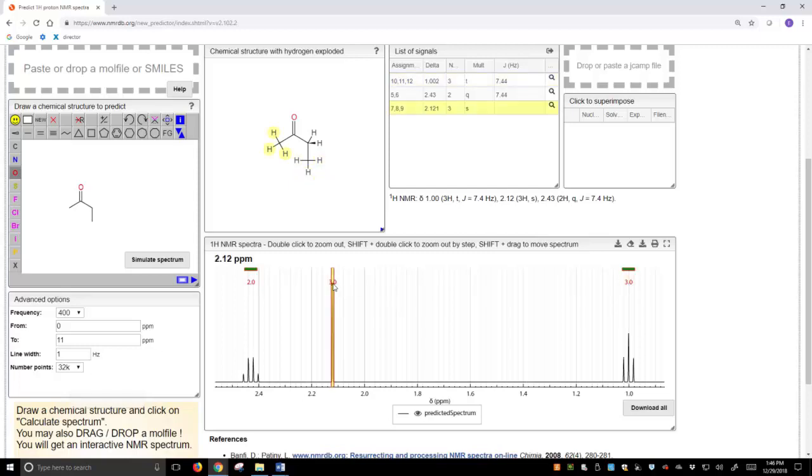So this is a really nice tool and interface. It's very flexible. We can draw whatever we want and predict an NMR spectrum, and then interpret that NMR spectrum.